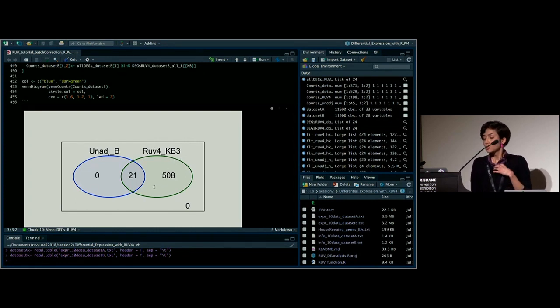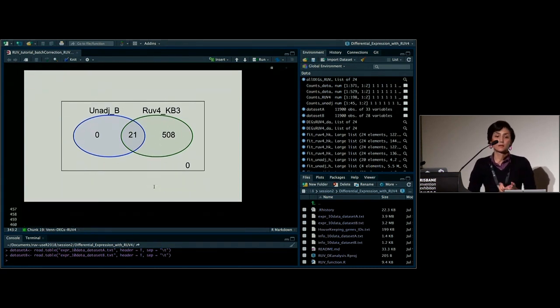So one thing which is important is that, as Mari said, we didn't have a positive control, for example, to look at something like rank plots. But that's why we split the data into two groups, trying to obtain differentially expressed genes in one dataset and then compare the result to see how consistent we are. But it would be a great idea always to have some positive controls in advance.